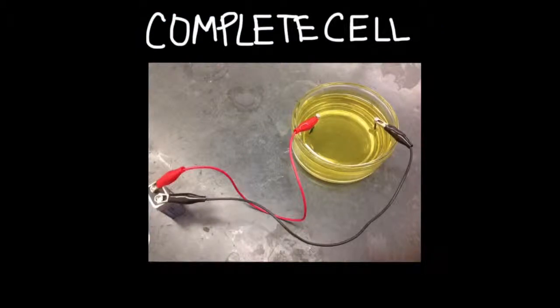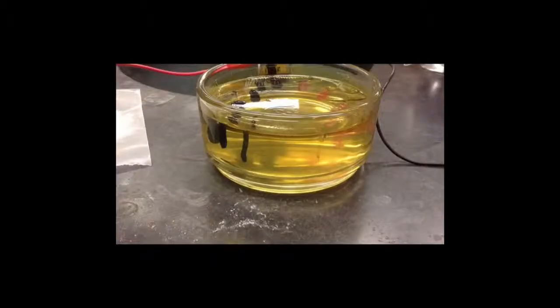Here is what my complete electrolytic cell looks like. Now let's see the cell in action. Before we begin, I would like to note that these videos are not of my first trials, as the more I kept practicing, the better my results were. Now let's watch.